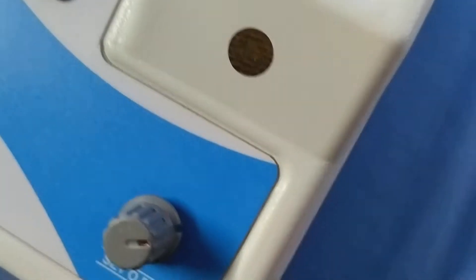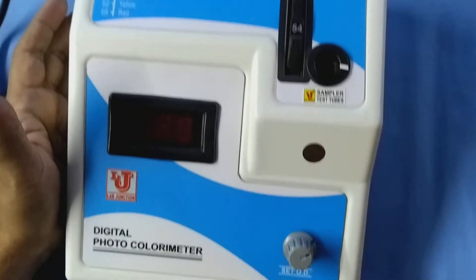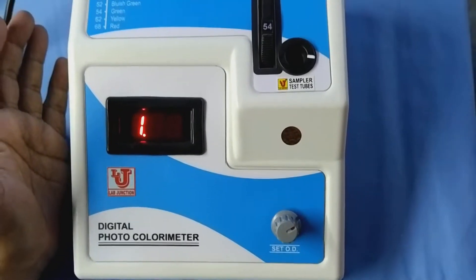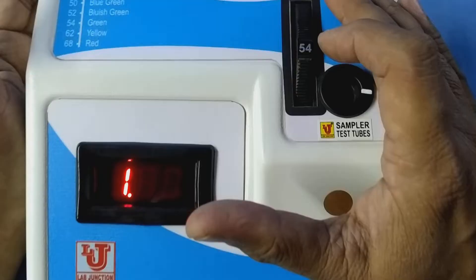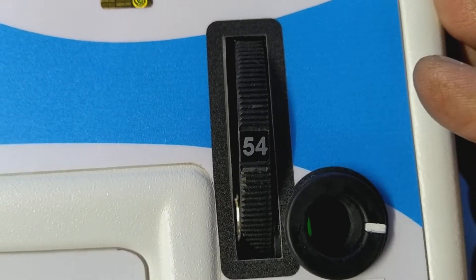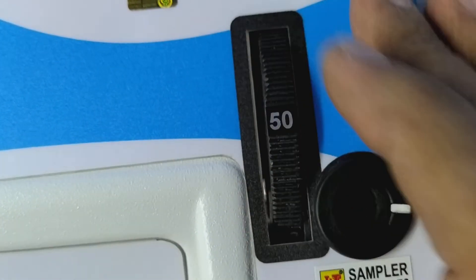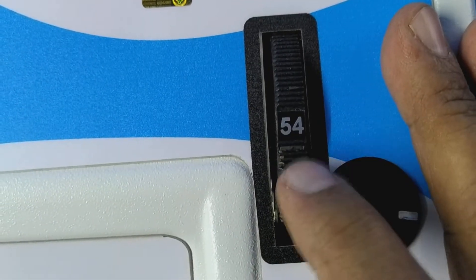Now, how to use this colorimeter? Switch on the instrument. Set your wavelength for your test. Suppose my test is glucose — glucose is done on 540. So, like this way, you set your wavelength from the filter disk.